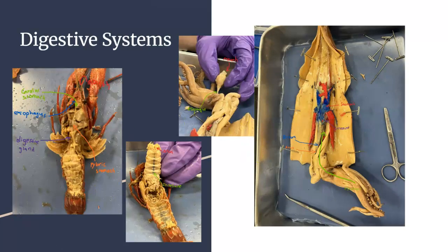Okay. So both of these organisms have a complete digestive system, meaning that food enters through the mouth and exits through the anus. Pretty straightforward. The way they break down food is a little different. For the crayfish, food passes through the mouth and esophagus into the cardiac stomach, which is where initial digestion begins. Remember, crayfish have teeth in their stomach, in this cardiac stomach, which help them grind down food. Once those gastric teeth grind down food, it enters the pyloric stomach for further digestion.